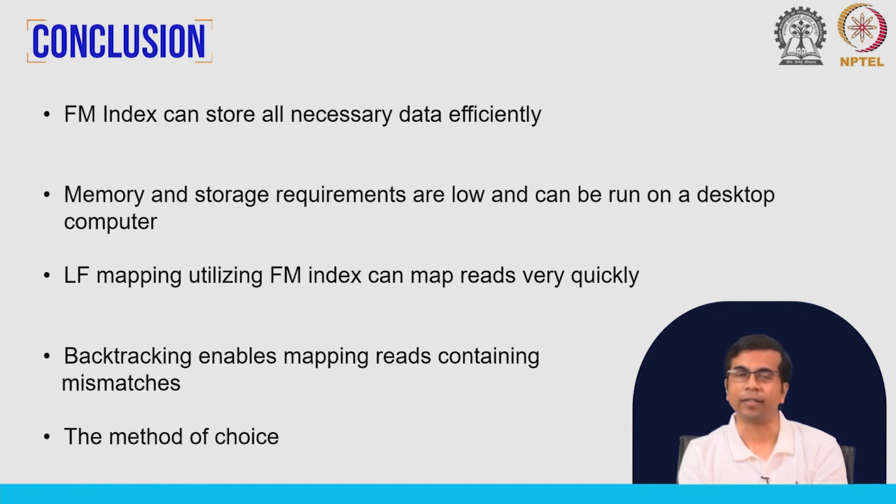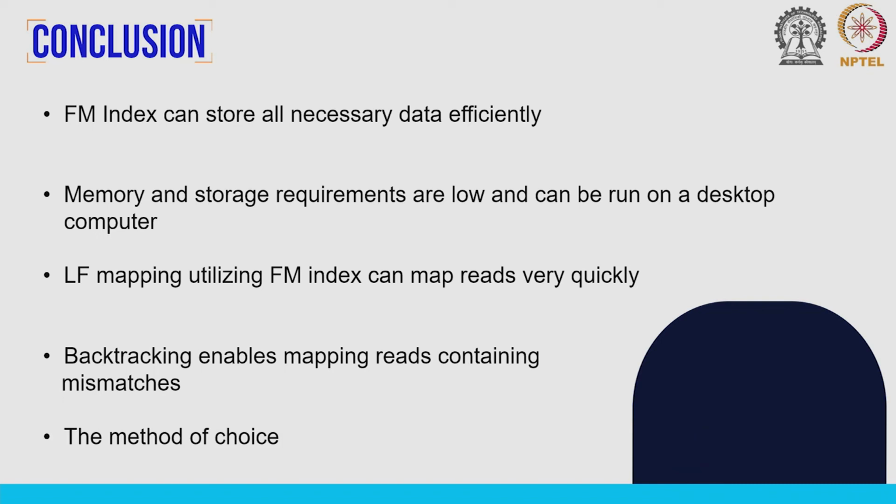That is why this is the method of choice, and for most of the mapping that we do in NGS data sets, we use this method most of the time.